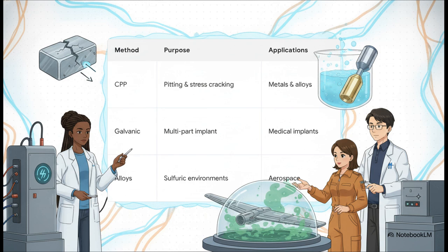fraction of the time. We've got standard tests for evaluating aerospace alloys in incredibly harsh sulfuric environments, and galvanic tests for multi-part metallic medical implants and simulated body fluids. We have to ensure these bimetallic contacts are completely safe inside our bodies, right?